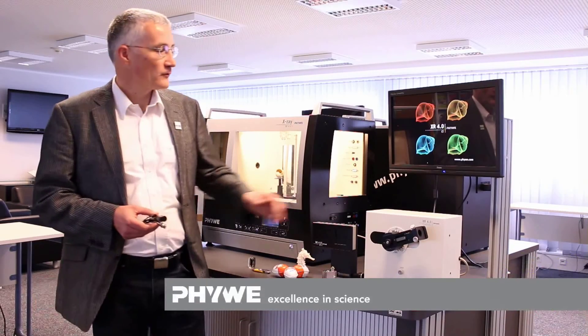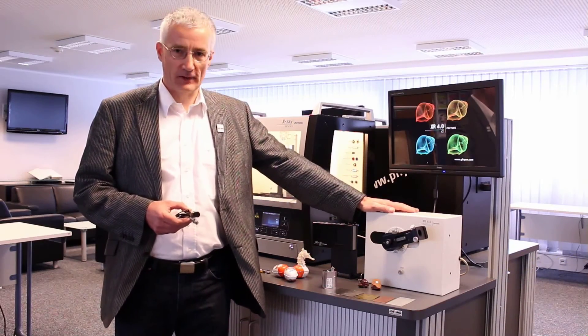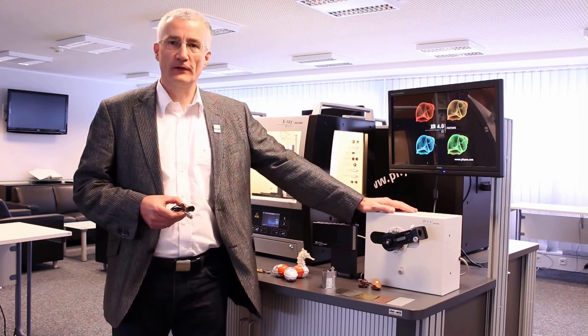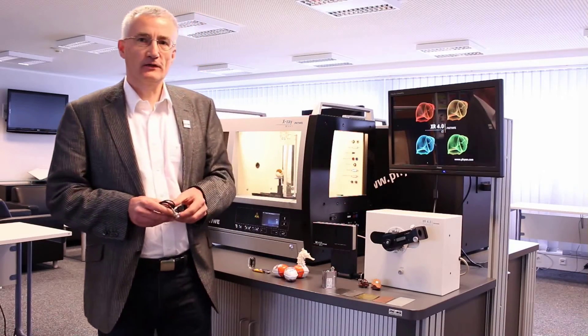Of the three detectors in our program, I want to start with the Geiger-Müller counter. It works together with the goniometer, which is self-calibrating. With both you can study principles of X-ray physics, or in chemistry, powder diffractometry.